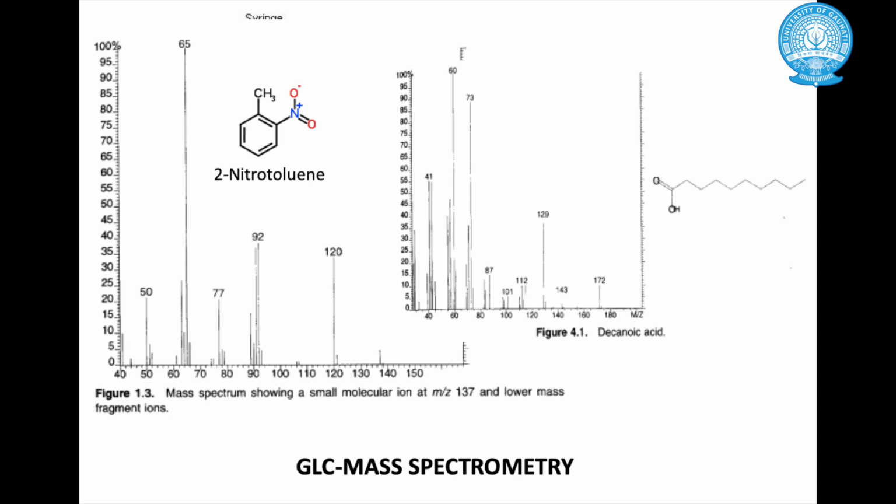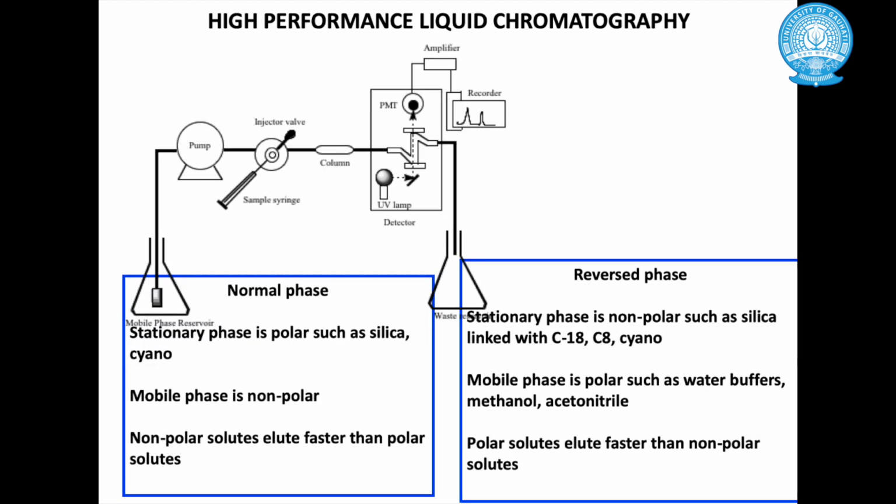A high performance liquid chromatography system is nothing but a simple chromatography column attached to a high pressure generating pump, and because of that the sample is separated under pressure, and this high pressure is required to push the samples through the column.